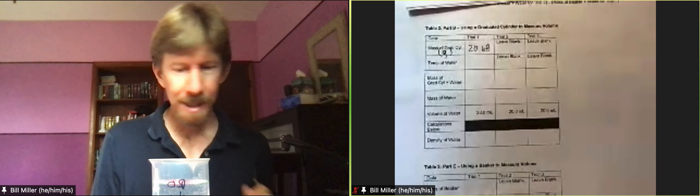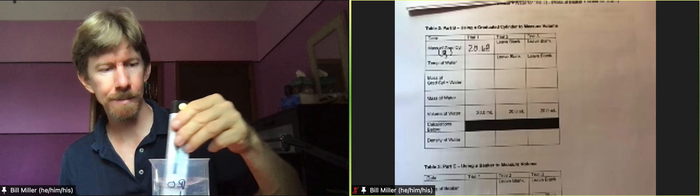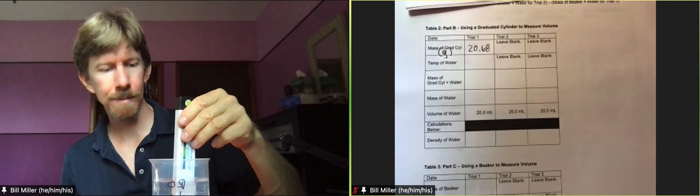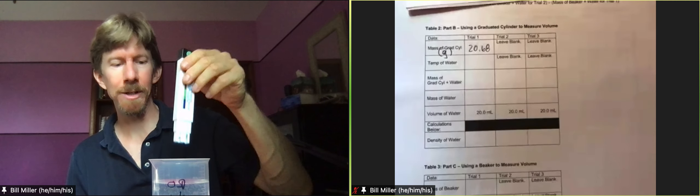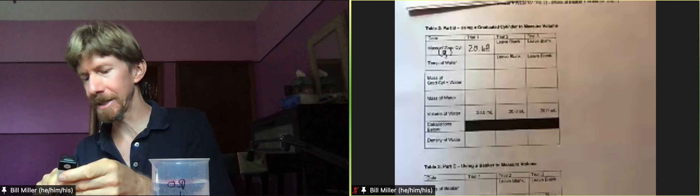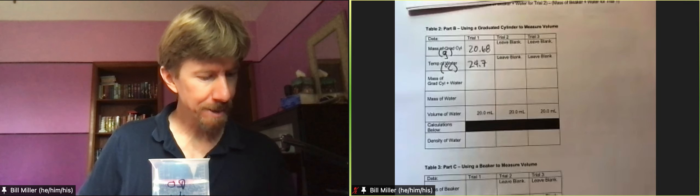Now it's time to take the temperature of my water again. Turn it on, press mode twice for mine. Some of them it just appears. This time for me I get 24.7 degrees Celsius, so I'll turn that off and write down 24.7 degrees Celsius.